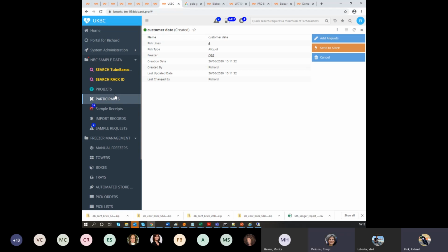Does anybody have any questions? Hi, this is Brandon. I do have a question. We often get into discussions about a hybrid storage solution, meaning a customer that can store samples in a store on site, but also with our off-site services. What can a customer get out of that we can offer? How can they see their different collections? How's that dashboarded?